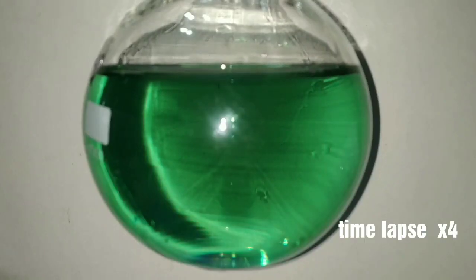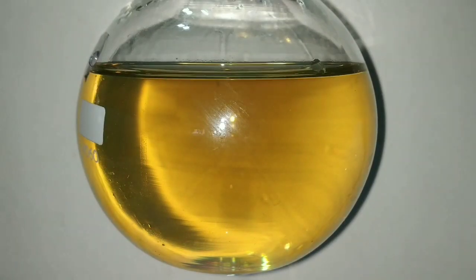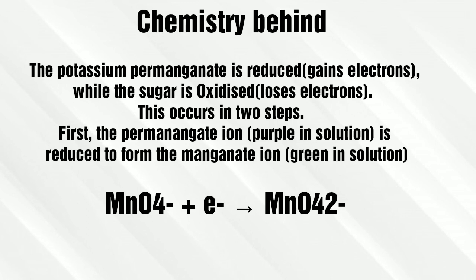On standing, the solution slowly turns to a yellow color, and on further standing it turns into an orange to yellow color. After about 40 minutes, you can see that the solution has turned clear. Here the potassium permanganate got reduced while the sucrose got oxidized.